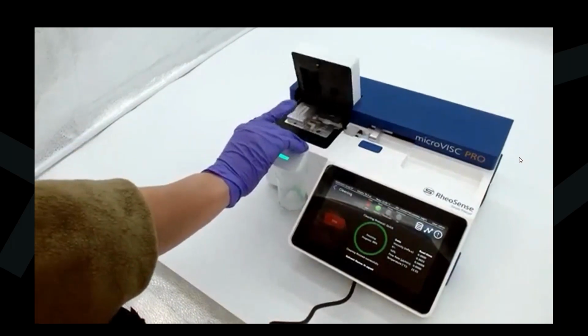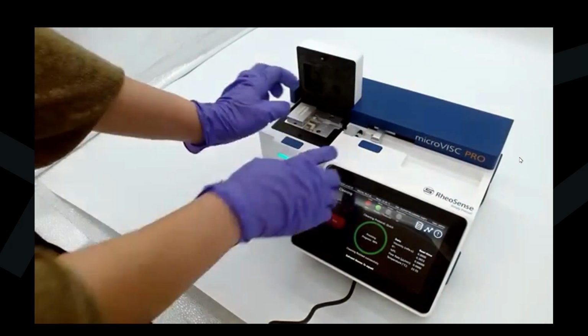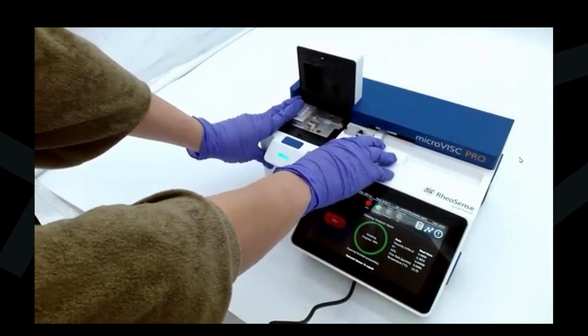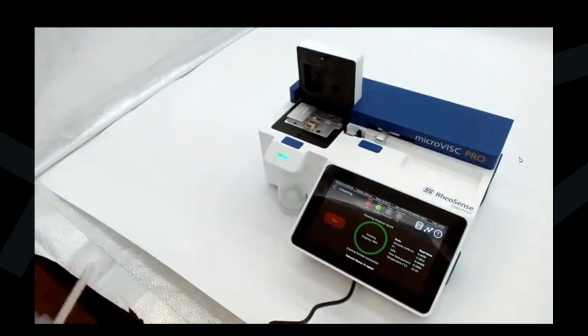And you finish the cleaning cycle. So now we remove the pipettes, and then your instrument is ready to measure more samples today, tomorrow, next time you want to measure with it.